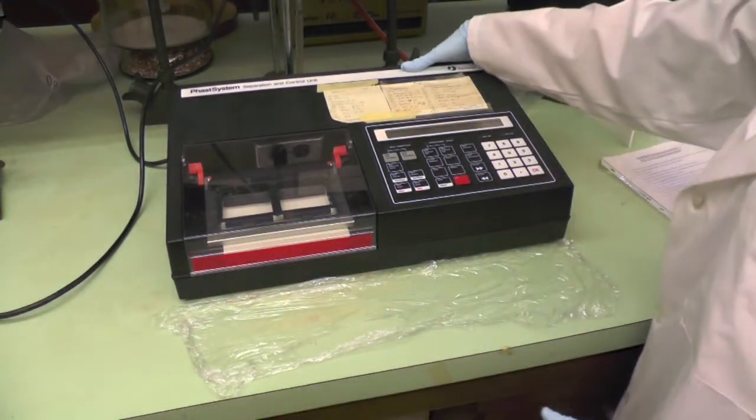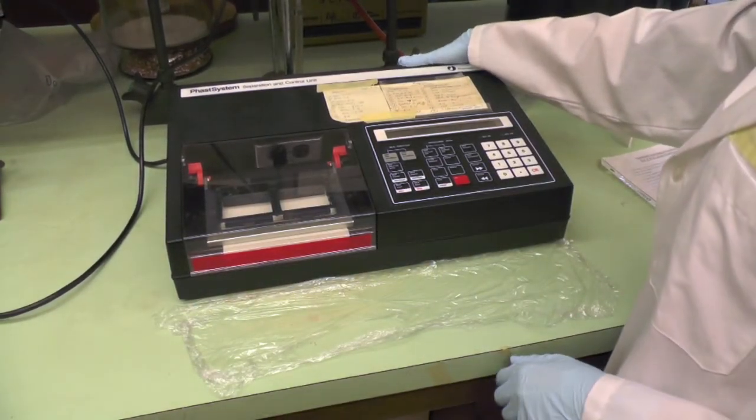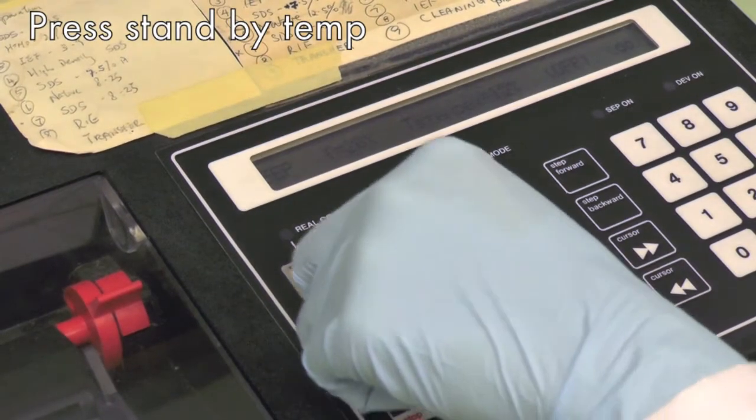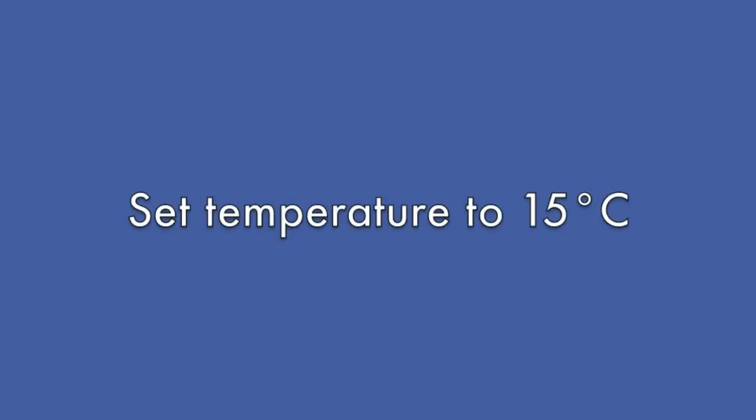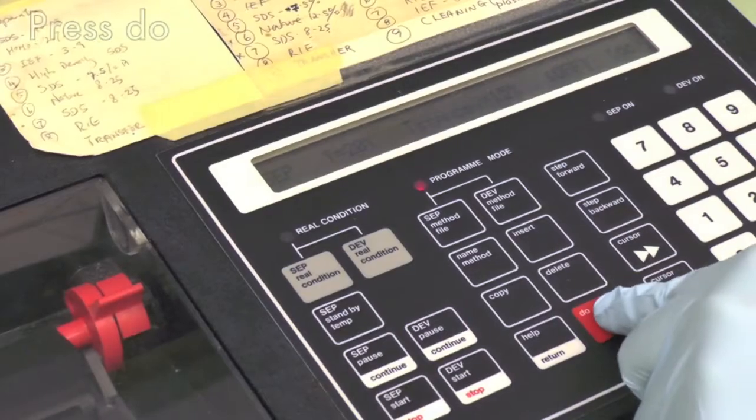Turn on the machine by pressing the button at the back of the system. Set up the machine by pressing standby temperature and set the temperature to 15 degrees Celsius, then press do.